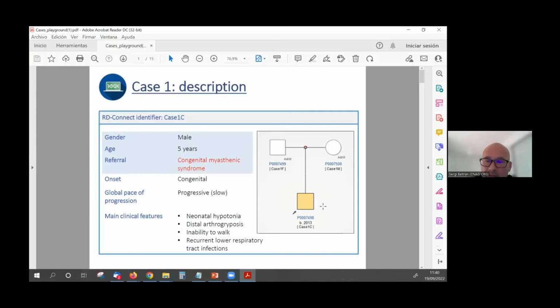So we could think about maybe a de novo mutation, something that the parents didn't have, but the kid does. We could also think about a compound heterozygous case, since they are not related, but in some cases they could be related and we don't know, and then we would have a homozygous recessive option. But we'll go straight away with the de novo option in the demo to keep things short.